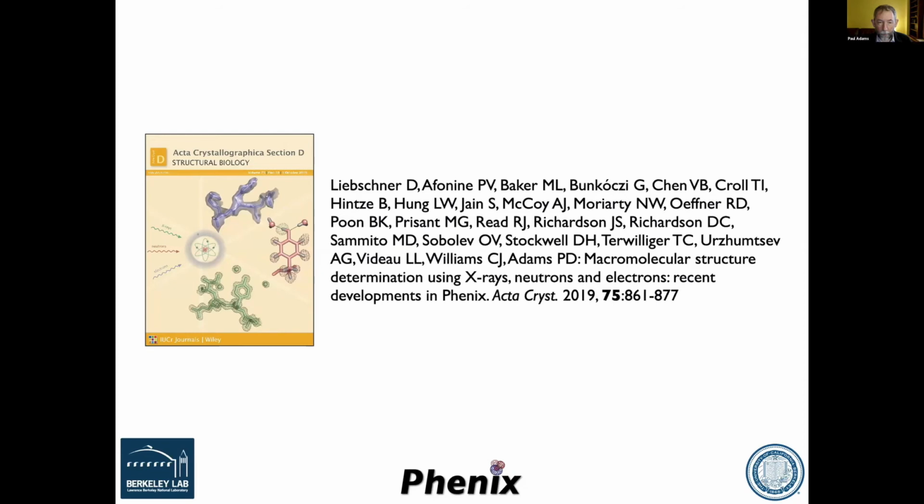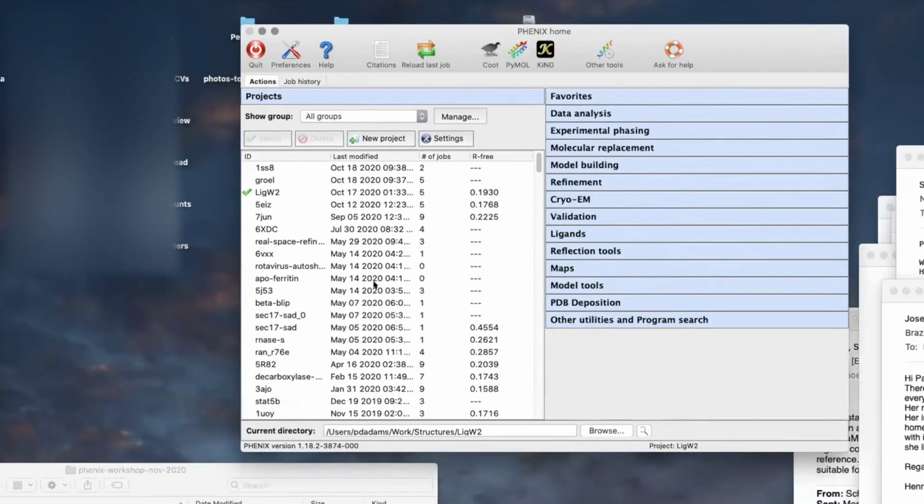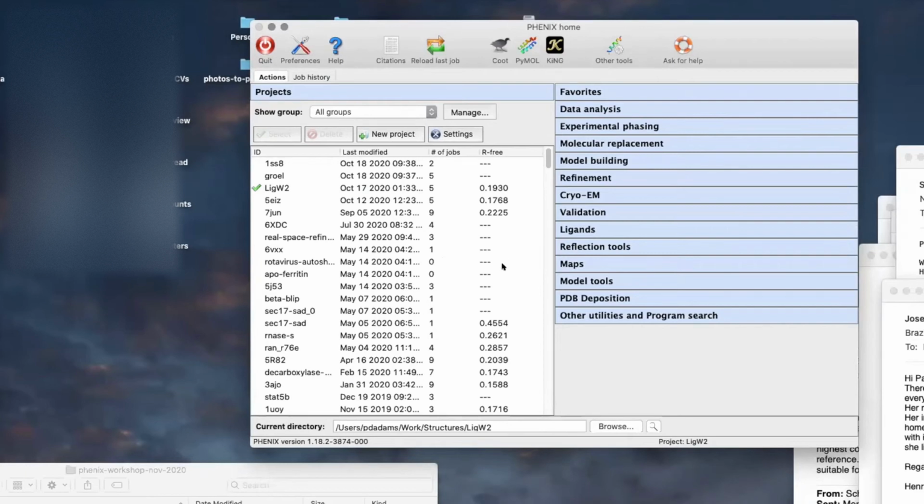What I'm going to do now is start up Phenix. So if you have it on the paper as well, great, thanks. If you have questions about anything I've just said, feel free to drop it in the chat. As you're doing that, what I'm going to do is just very quickly, for those of you that are not familiar with the Phenix interface here, just quickly describe it.